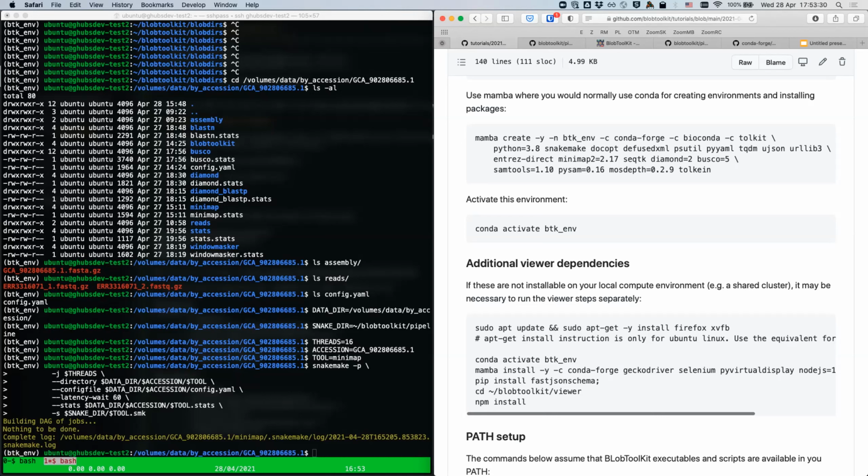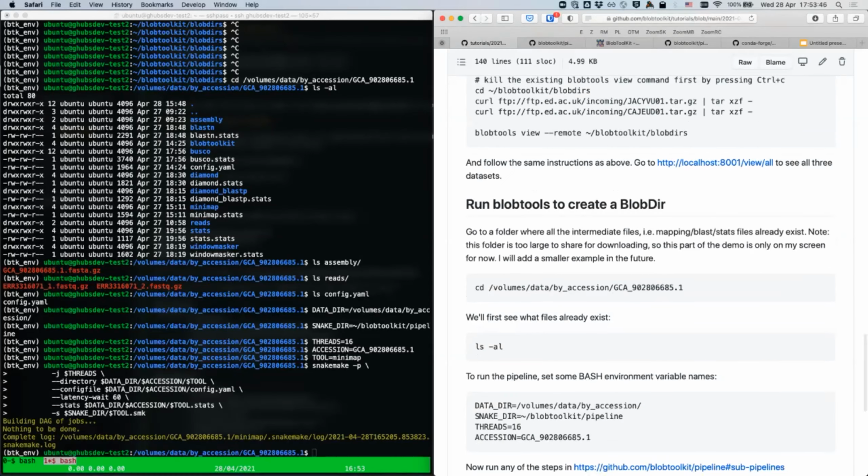I'm only showing you what you would do if you had to run these steps. And there's lots of reasons to do that. Also you might want to rerun one part of it because you've got an extra BLAST step. That's an excellent question, and I'm sorry that I wasn't clear about it. Does anybody else have a similar question, before I move on to the next step?